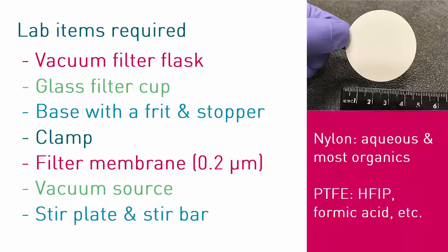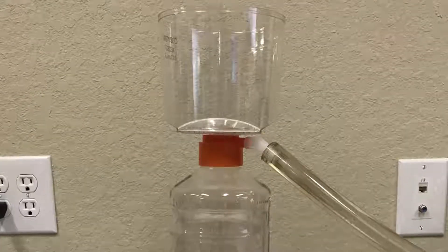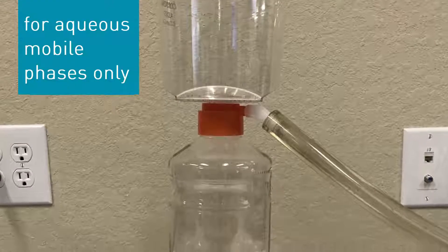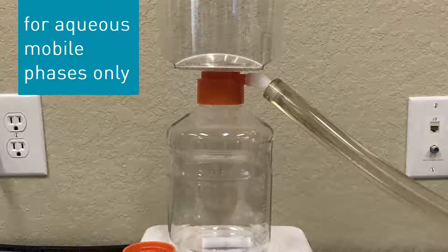The filter membranes should be nylon for aqueous and most organic mobile phases, and PTFE for HFIP, formic acid, and other solvents that will dissolve nylon. Alternately, a disposable all-in-one plastic filtration setup will work for aqueous mobile phases and buffers.